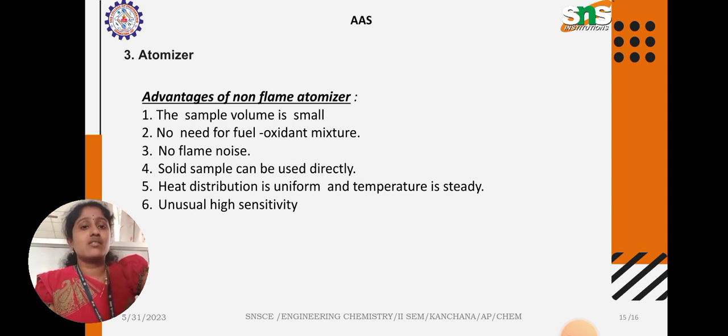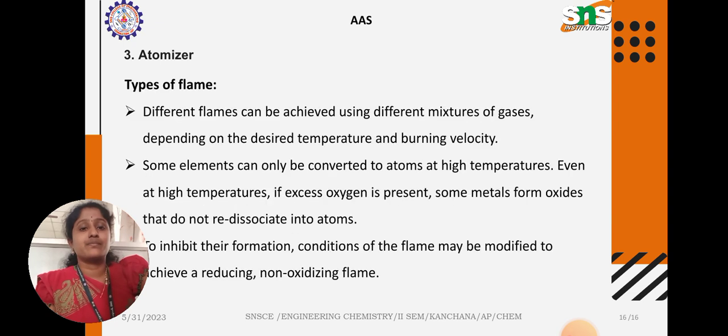Atomizer. Advantages of non-flame atomizer: the sample volume is small, no need for fuel oxidant mixture, and no flame noise. Solid sample can be used directly. Heat distribution is uniform and temperature is steady, and unusually high sensitivity.